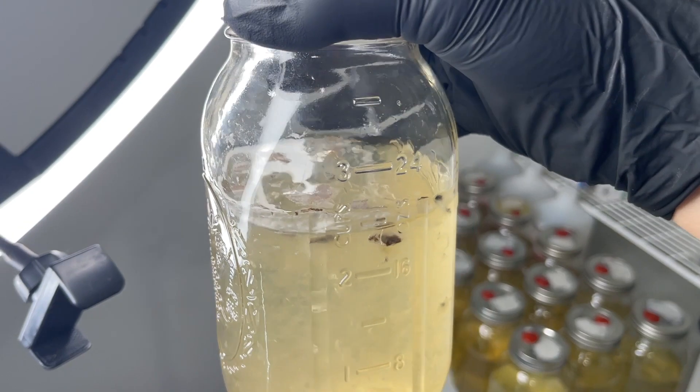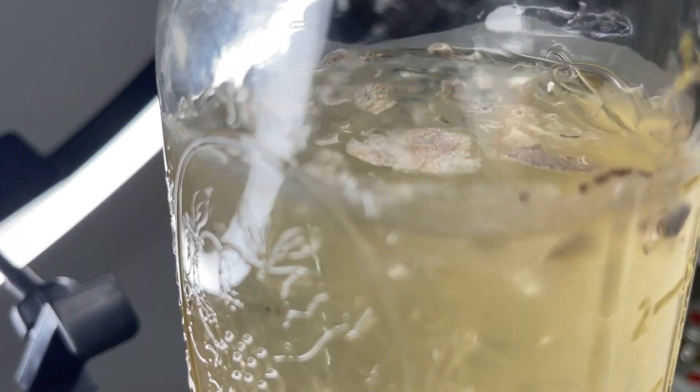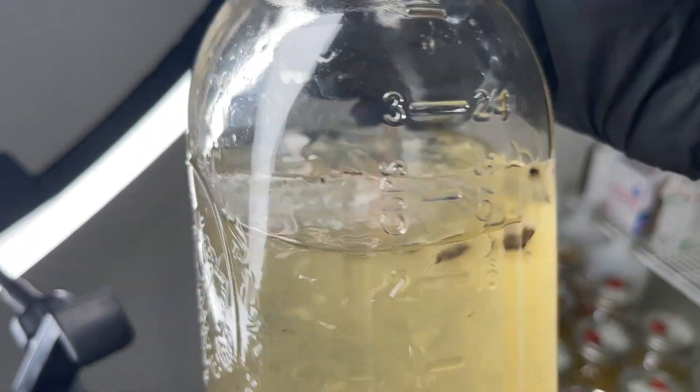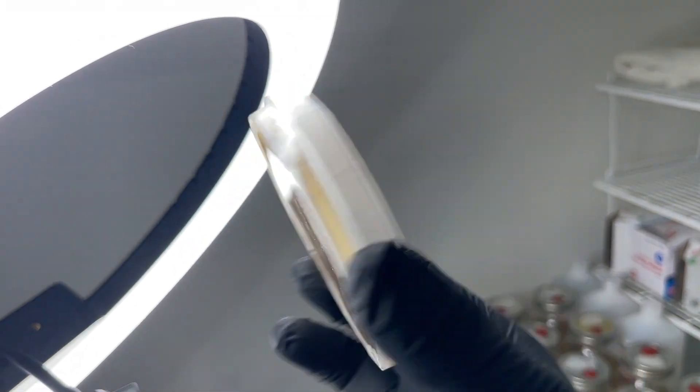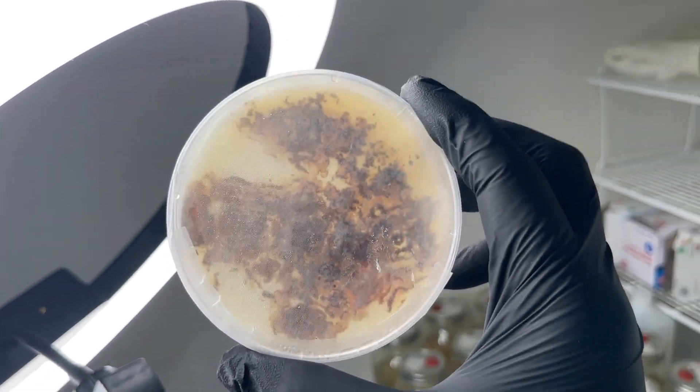This is another jar of pioppino. You can see that it's just starting to turn brown on the surface. The mycelium of pioppino will also turn brown on an agar plate.